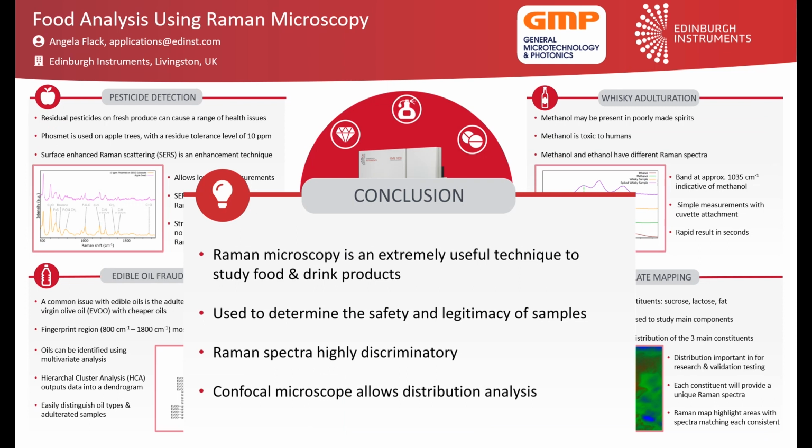To conclude, Raman microscopy is an extremely useful analytical technique across the food and drinks industry. It helps to ensure the legitimacy and safety of products whilst also allowing distribution analysis.